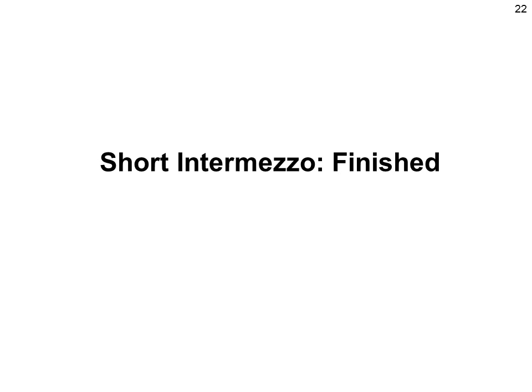This finishes our short intermezzo about isotopes. Remember why there is an isotope fine structure, mainly due to the presence of carbon-13 in nature. And importantly, remember how the distance between the isotopic peaks can lead you to determining the charge state of the ion, which is essential to calculating the correct molecular mass.